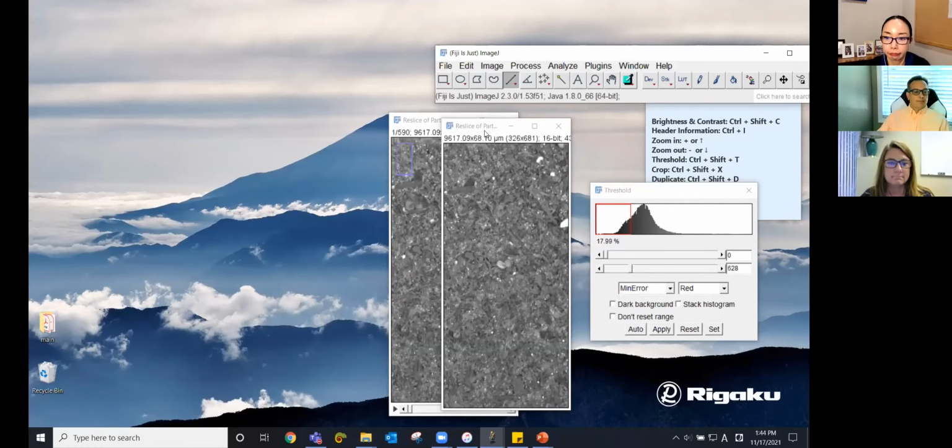Okay. All right. So a couple more questions, and then we'll get on to the next session. Jennifer's asking, do you continue to press Control M to get the new measurements after you slide through a slice in the resliced volume? So do you have to press Control M every time? Every time, right. You go to a new slice and hit Control M and you get a result for that slice. Then you go to the next slice and you hit Control M and you get another number.